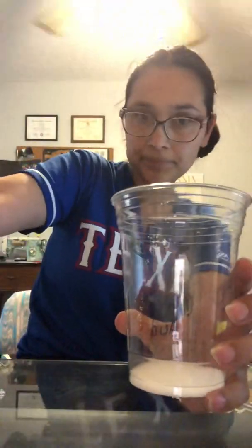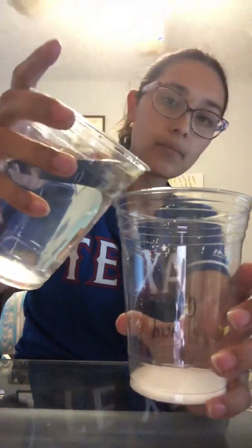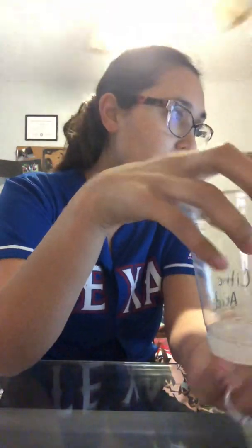We're going to put water in, and mix. Right now it's cold, colder than the water that I put in it. And the crystals are dissolving.